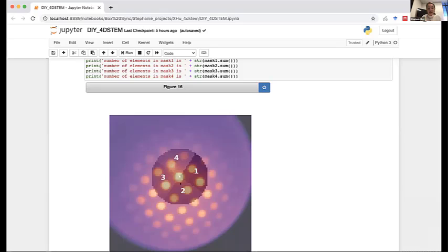You have two lines here, and the way I made them is by creating lines with point-point form. I defined a second point. We know the first point already because we found the center of our diffraction pattern, and immediately that defines our first line. Then using a matrix, I can rotate that by 90 degrees, and then I have two lines that are perpendicular and can use that to divide up my circle into four detectors. And like I said before, this is very tunable. You could envision a situation where you have 6 detectors to account for 6-fold symmetry, or 24 detectors, or different detectors of different radii.